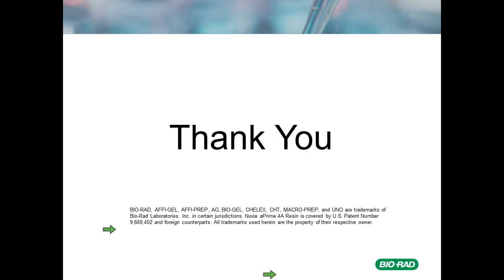Okay. So for plant-based vaccines, what recommendations do you have for purification? Yeah, that's another good question. I definitely recommend ion exchange for the capture step, again, because the binding capacities tend to be really, really high, and typically plant supernatants tend to be a little dirtier compared to other supernatants. So ion exchange can frequently be used with some aggressive washes as well to get rid of some of those contaminants.